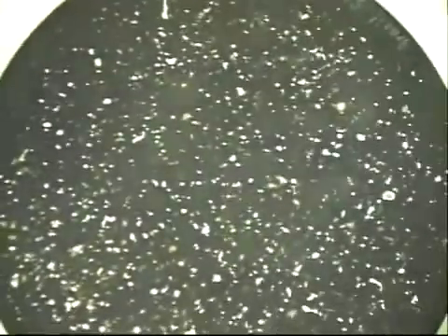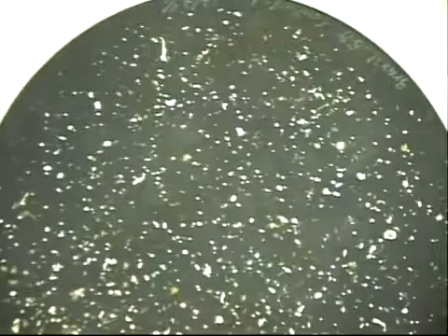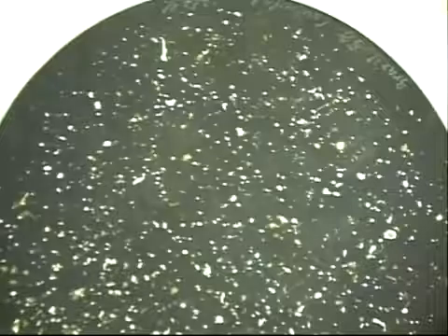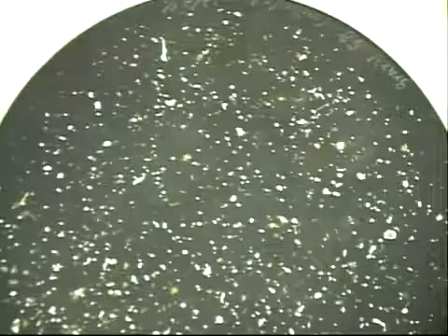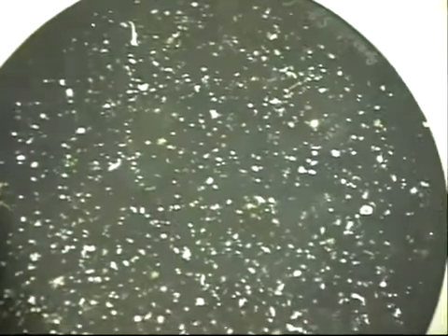I should put these on the scanner and show you there. But in any case, this has been processed through the carver press and using the Voith paper to activate the stickies and identify the stickies as separate from the other tramp materials that came with the process.